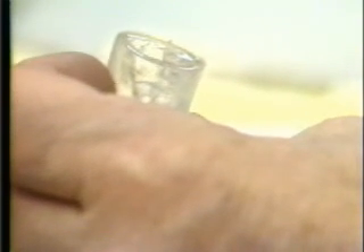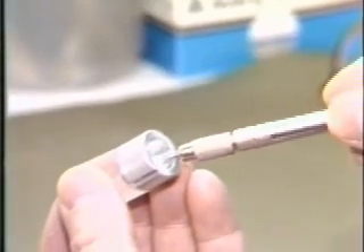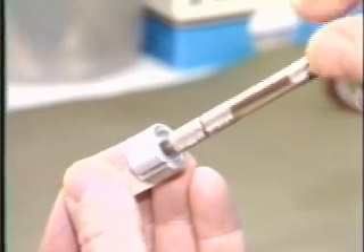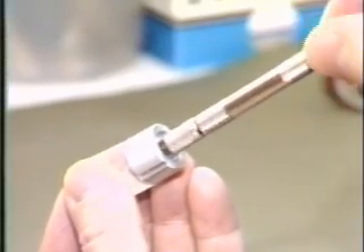Allow it to cure in a warm place such as a warming tray until it is reasonably hard. Depending upon the proportion of catalyst and temperature, this may take a few hours or overnight. When the resin is firm, re-drill the needle hole starting at the base using a number 73 drill. Now the mold can be trimmed and shaped with a grinding tool.